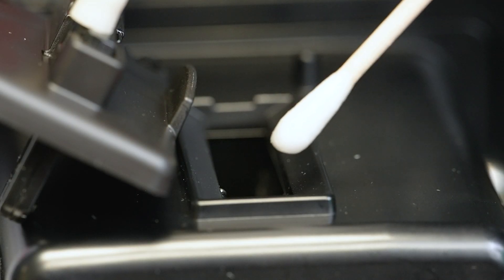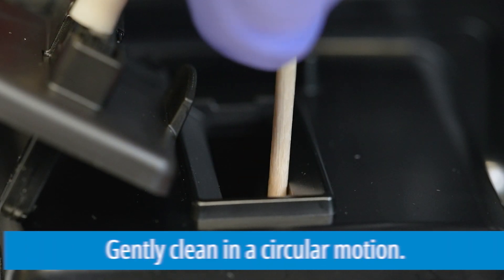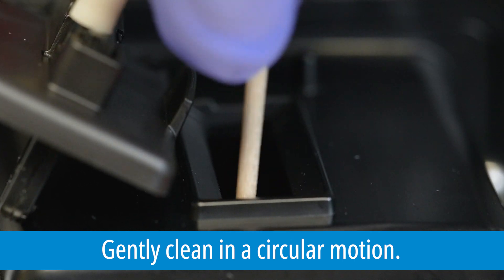Use lint-free cotton swabs to clean the colorimeter cell. It will be located on the front of the rectangular opening on the lid.